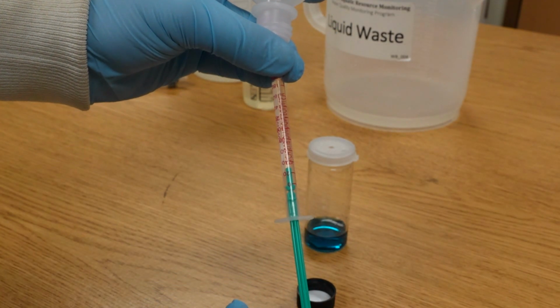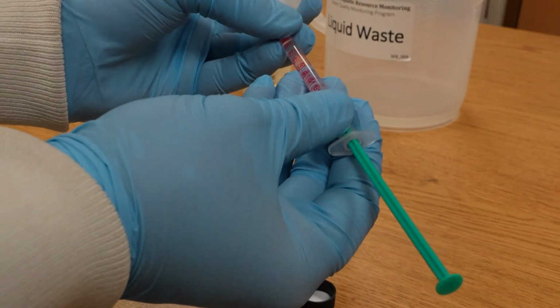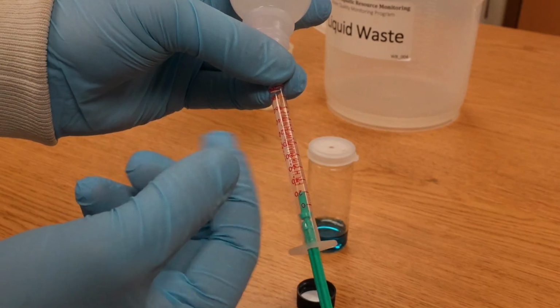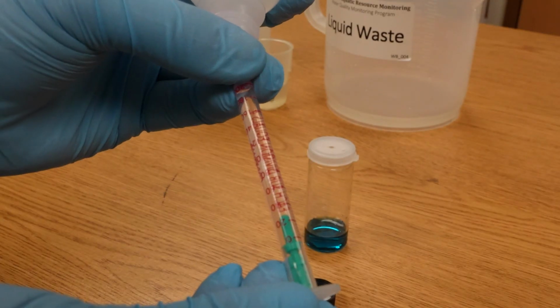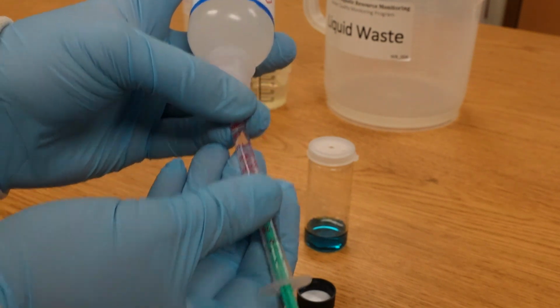Ensure that the large ring on the plunger is just behind the 0 mark. Remember, if there is an air bubble in the titrator syringe, remove it by gently tapping on the titrator to push the air bubbles to the top. However, instead of expelling into the waste bucket, push the solution back into the reagent bottle to expel the air bubbles and redraw the reagent. Then, turn the bottle over and remove the titrator.